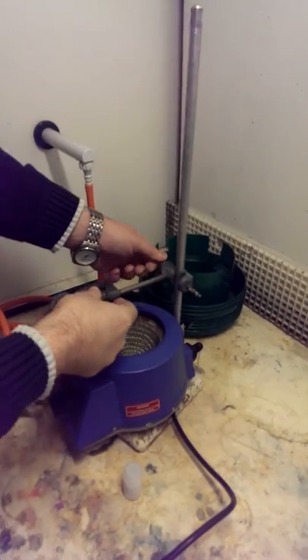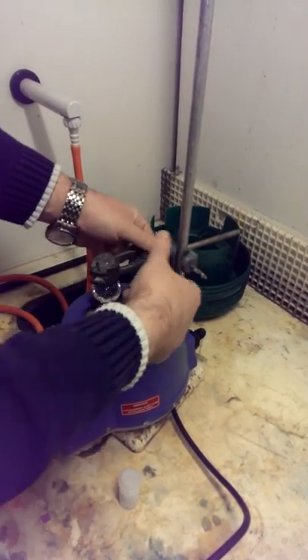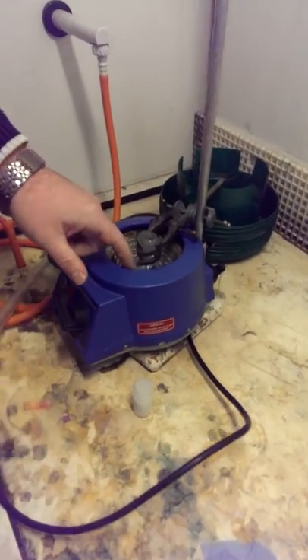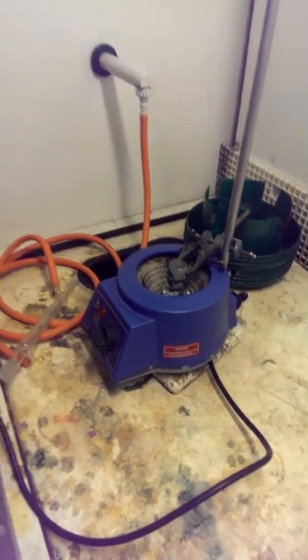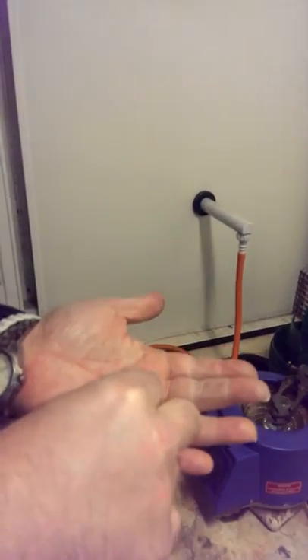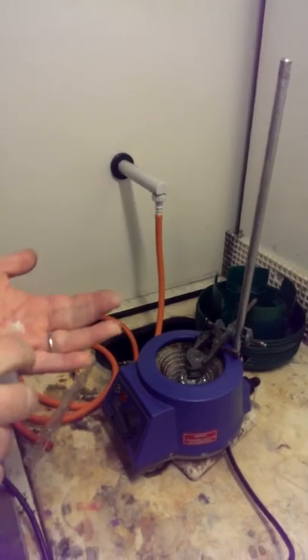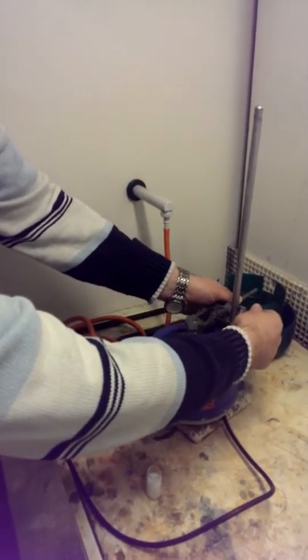Right, clamp the flask into position, into the mantle, making sure that it sits nicely into the mantle and doesn't touch the electrical element at the side. You need some bumping granules. So get yourself one to two bumping granules and drop them into the flask. This stops bumping.